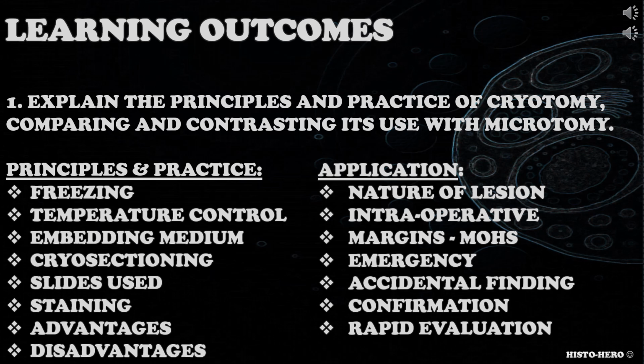What are the applications of cryotomy? Consider speed, preservation of specific molecules, no antigen retrieval, elimination of fixation artifacts, intraoperative cases, margins assessment for MOHS surgery, assessment of accidental finding, rapid evaluation, and so on. Try to compare and contrast cryotomy to microtomy as you explain the principles and practice of cryotomy.